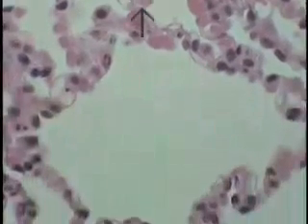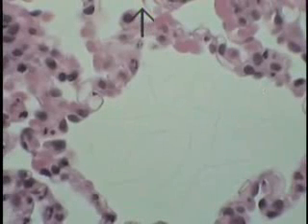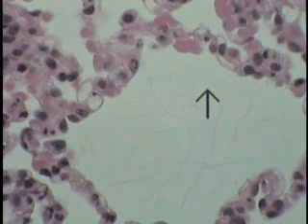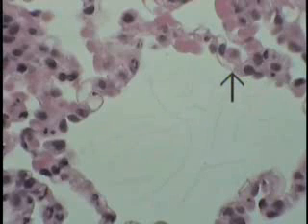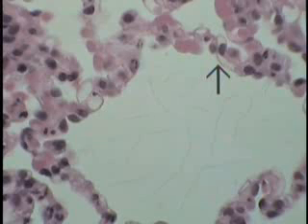But looking at this expanded alveolus, several features can be observed. First of all, this is the alveolar wall here. What's interesting and what can be visualized at this high magnification with the plastic type of material is this thin membrane coursing here and illustrated at the tip of the pointer.